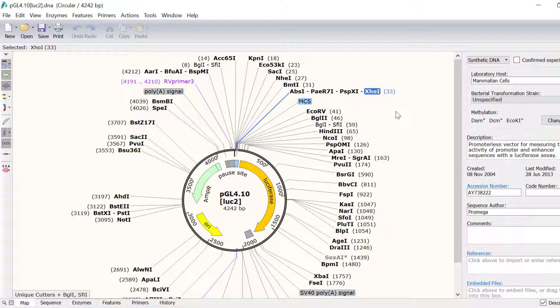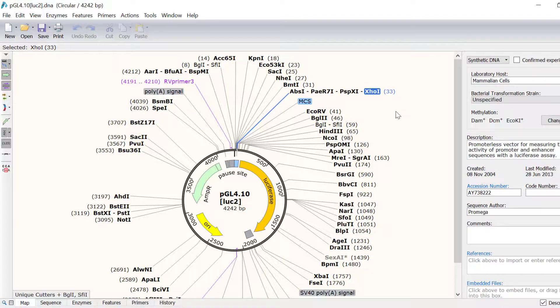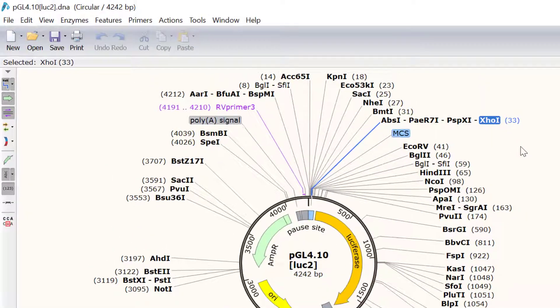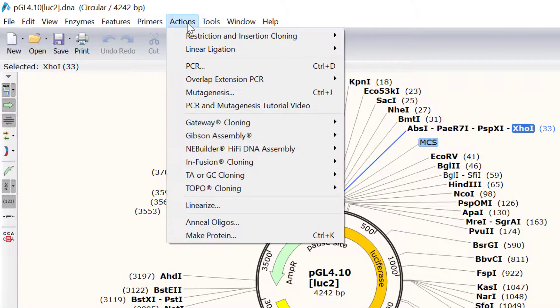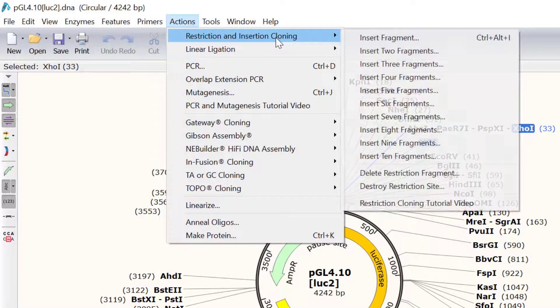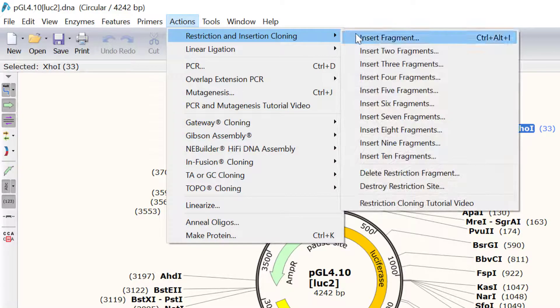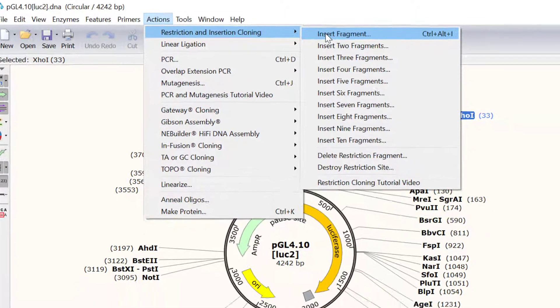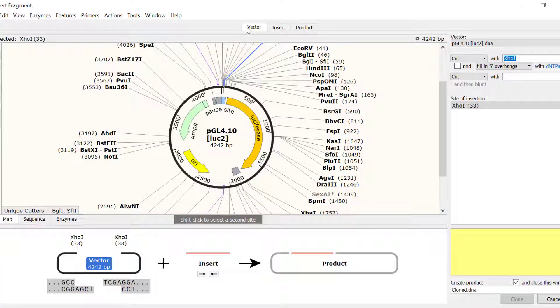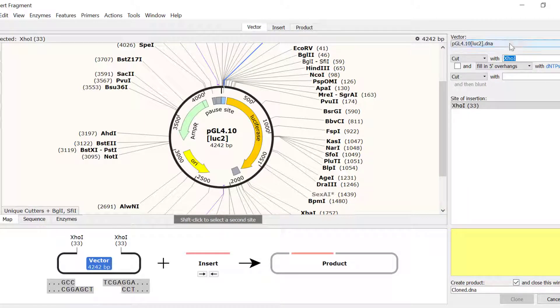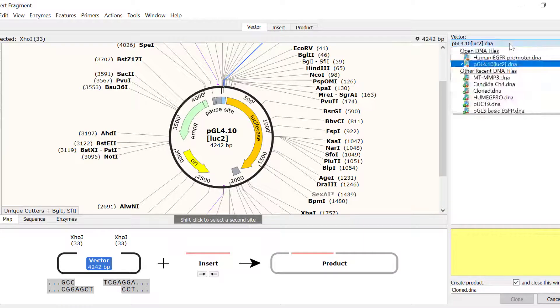Now we can simulate our restriction and insertion cloning. To do this, simply go to Actions, Restriction and Insertion Cloning, Insert Fragment. PGL4.10 Luc2 has been preselected as the vector. I can also select a different vector by using the drop down menu.